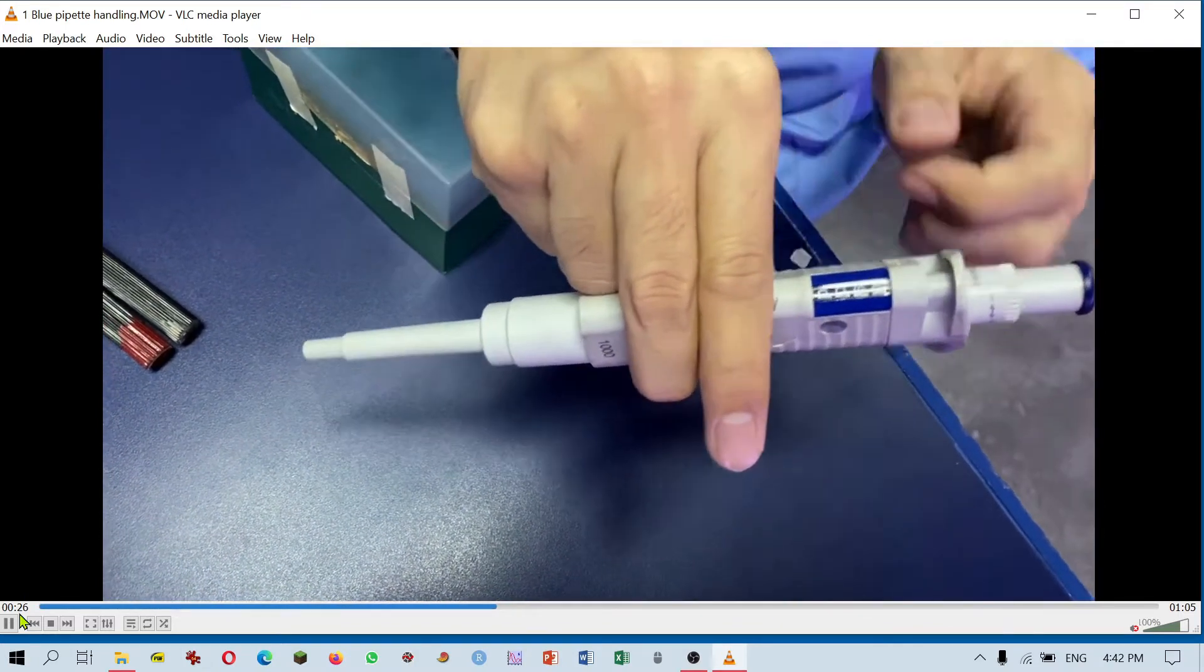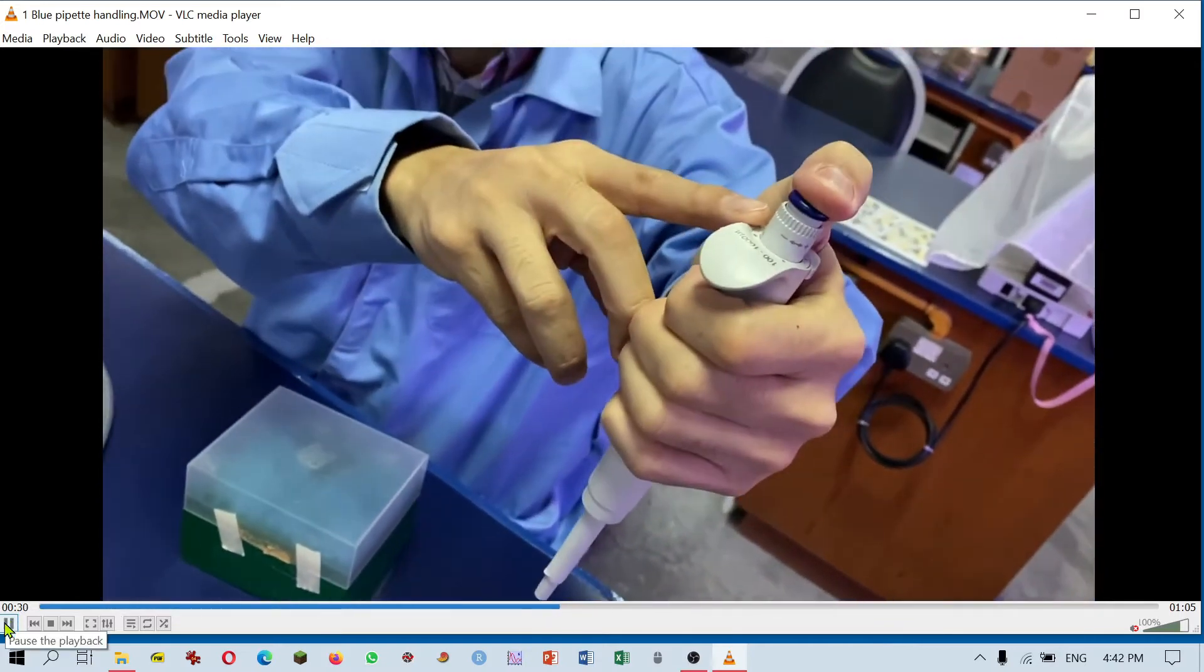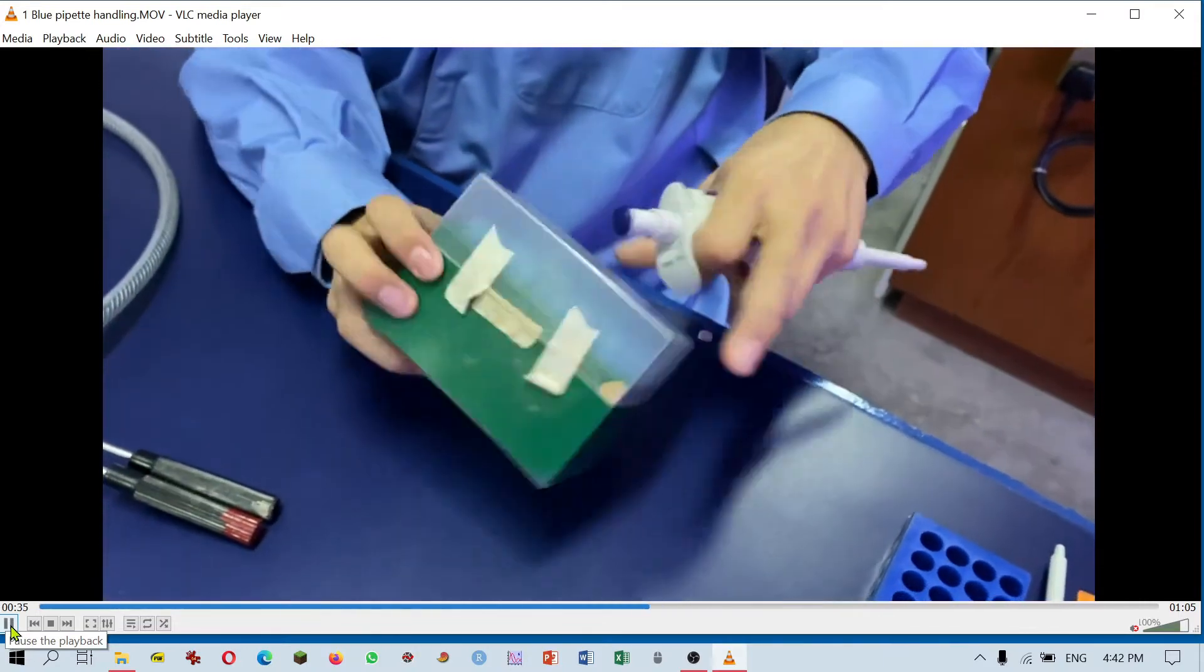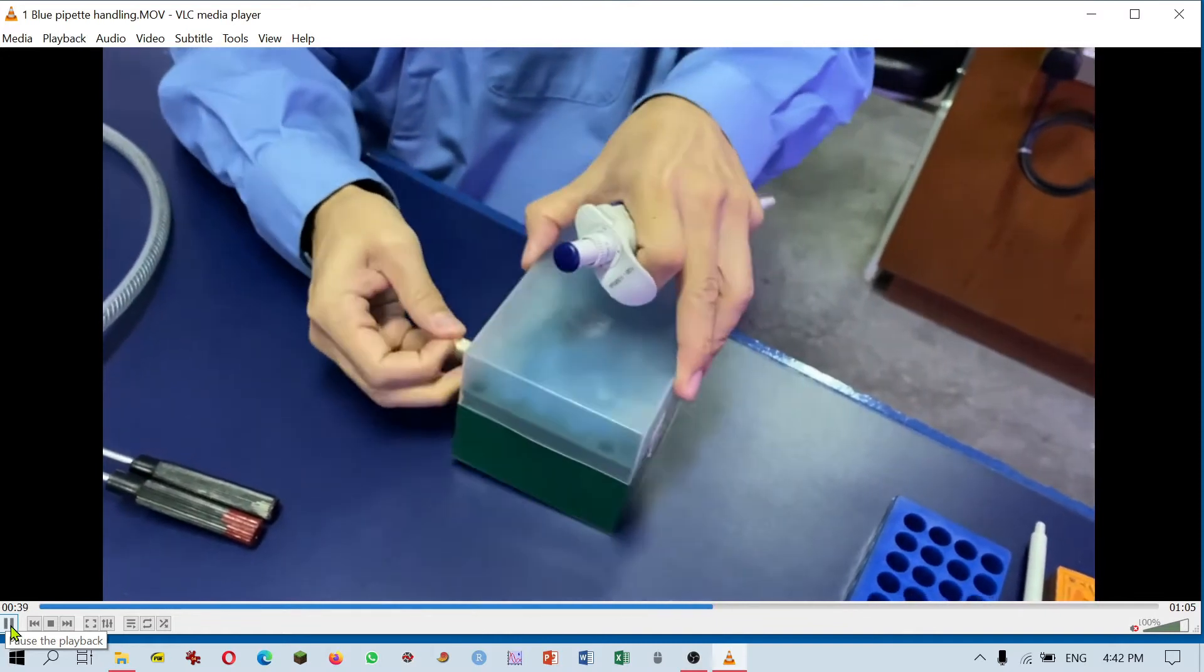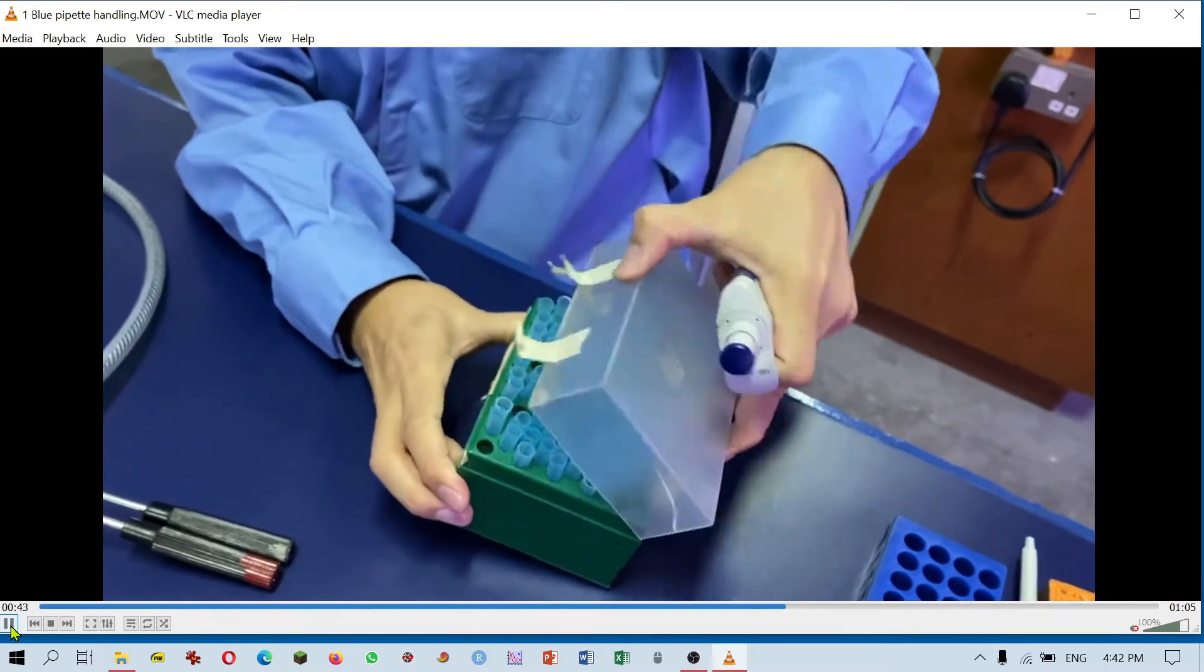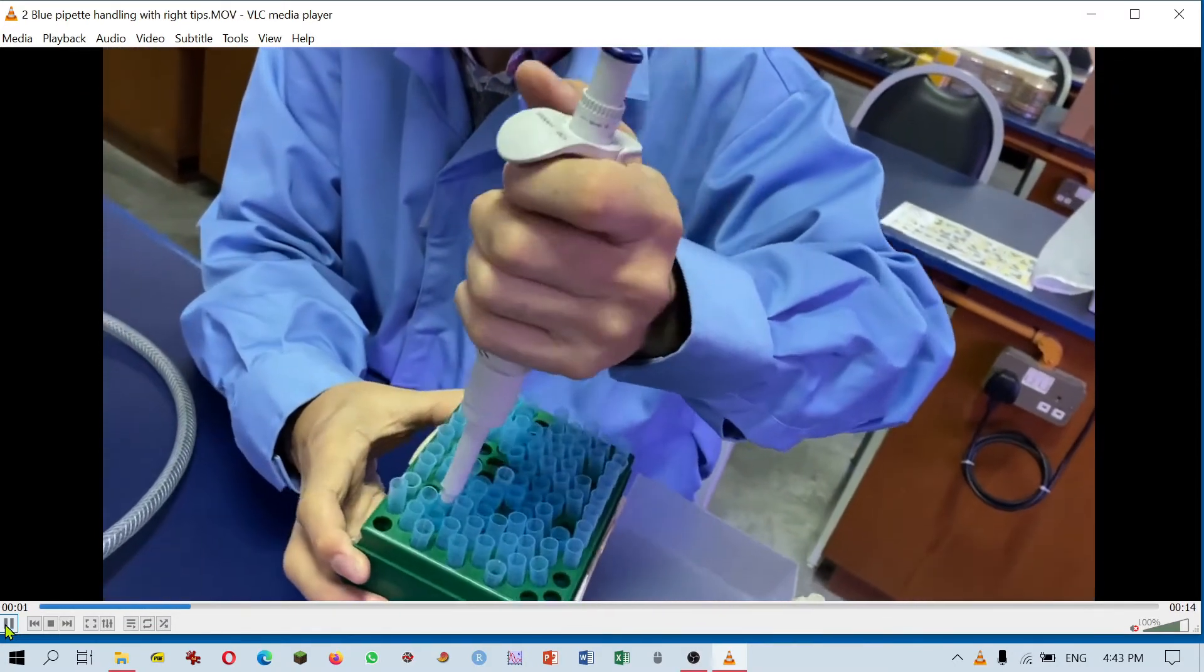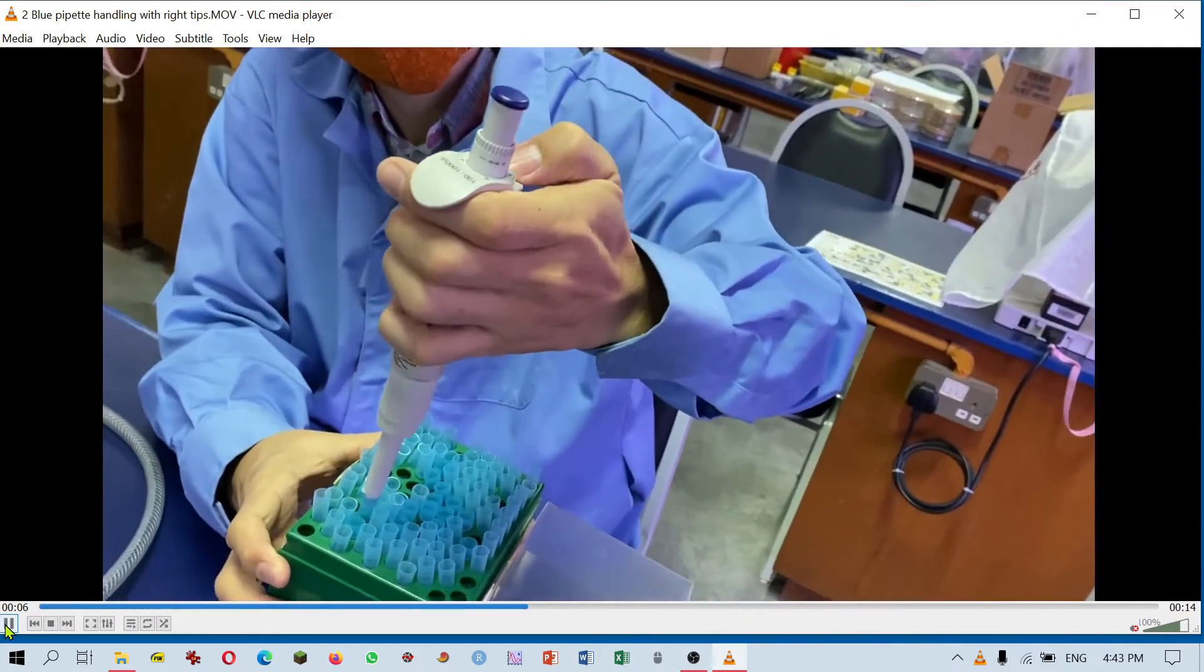This shows 900 microliters. This is how you aspirate and dispense the solution using the blue pipette. Here are the blue tips you can use to aspirate your solution and press the button at the back to eject it.